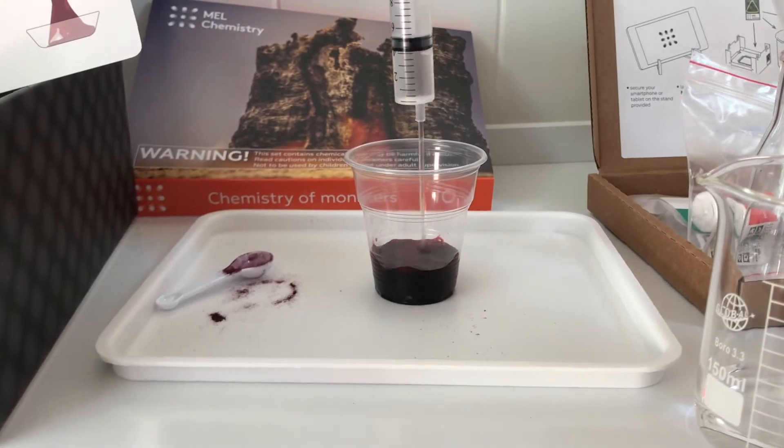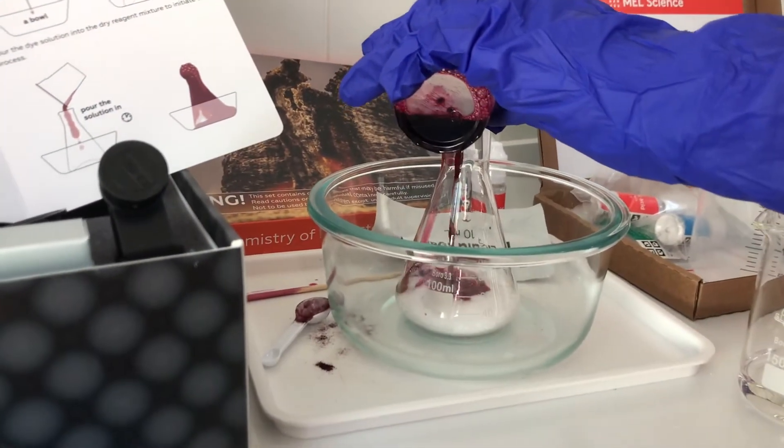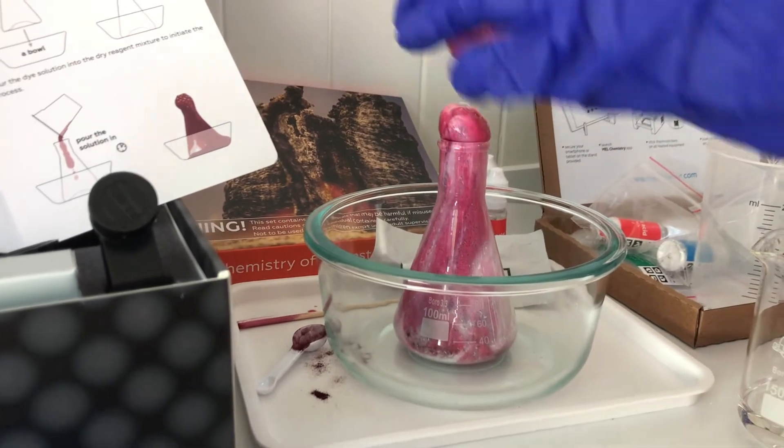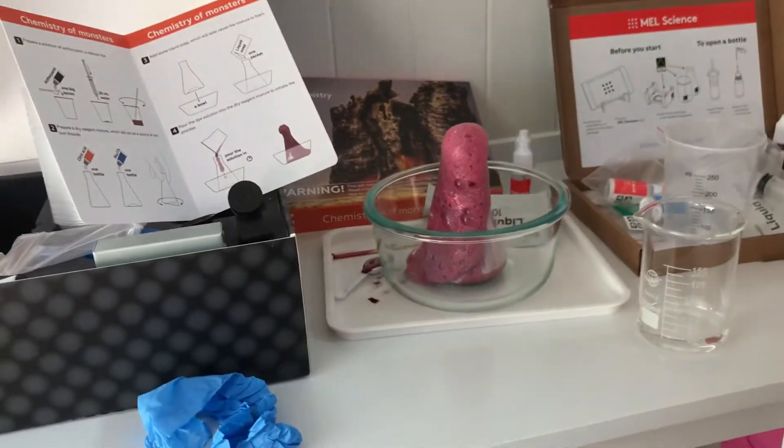You can see that we're mixing the different materials here. In order to do this, it requires you to take both solids and liquids, mix them in beakers, using the safety tray that they provided. And then voila — you get some pretty cool foam. Pretty fun.